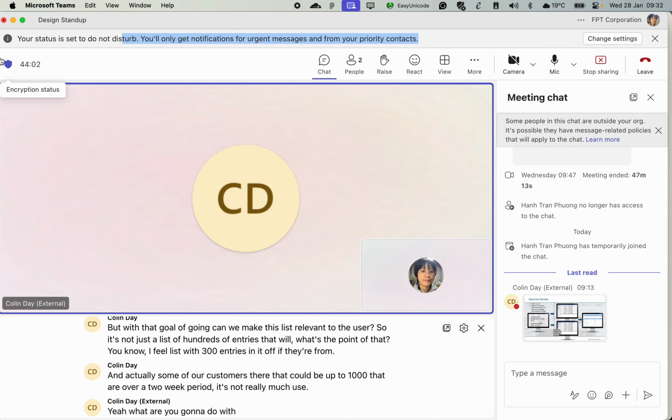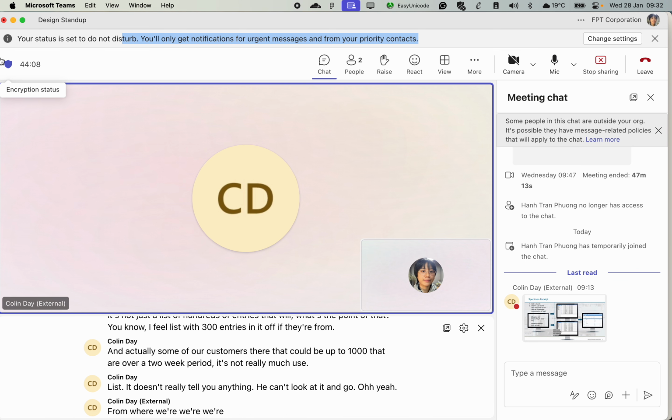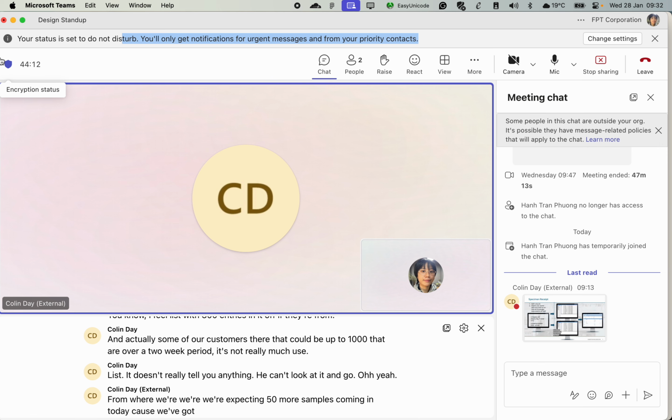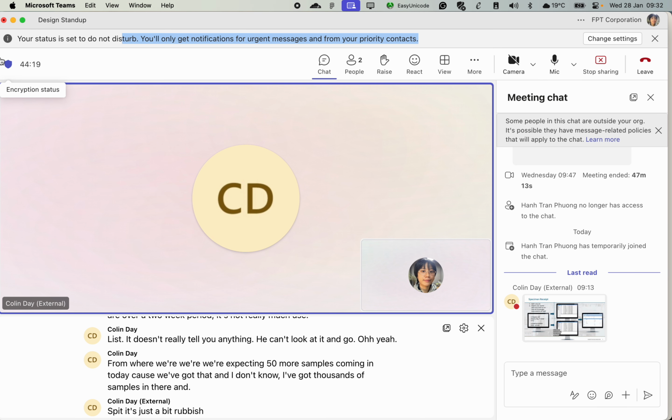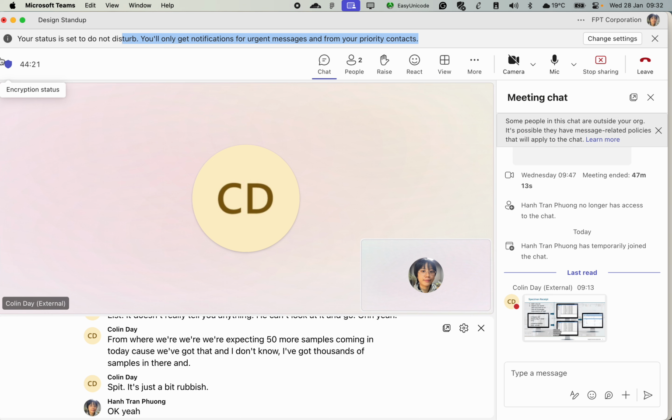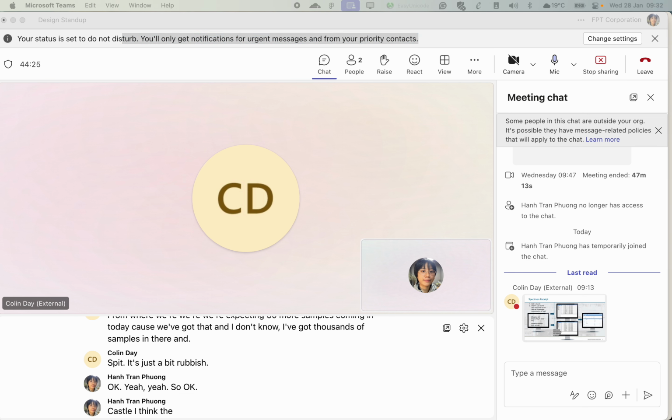What are you going to do with that list? It doesn't really tell you anything. You can't look at it and say, yeah, we're expecting 50 more samples coming in today. I've got thousands of samples in there, and it's just a bit rubbish. Okay, yeah. So I think the part for the list is pretty clear.